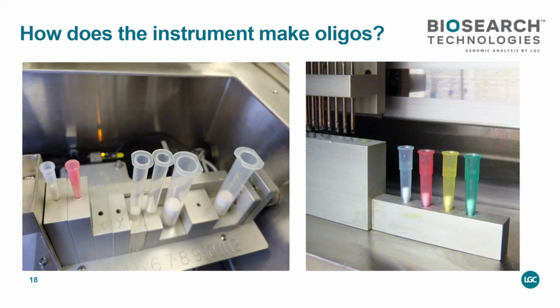The instrument tells you, okay, release that many microliters of this reagent. The valve opens up, it's like a little shower head. It comes into the column, and then the vacuum pump pulls it through. This is where your CPG is. There are two little filters, and the magic happens in between. The coupling step and all the reaction steps, except the wash, do have wait times.